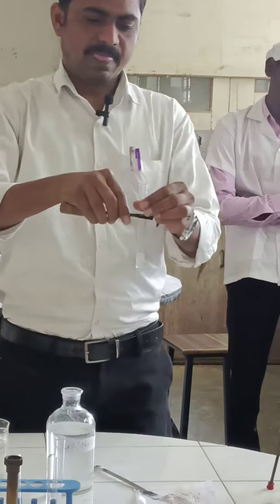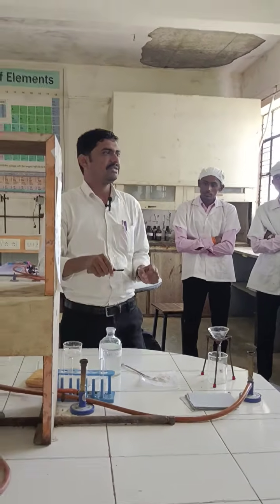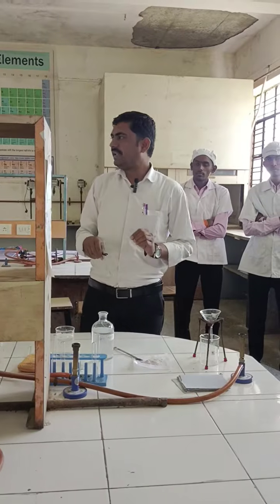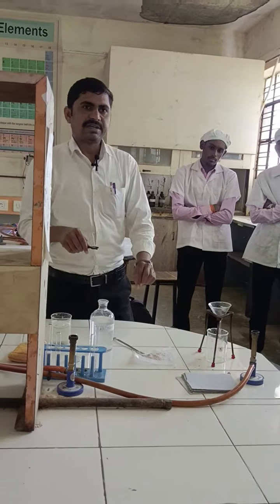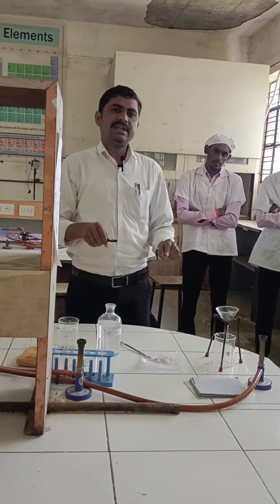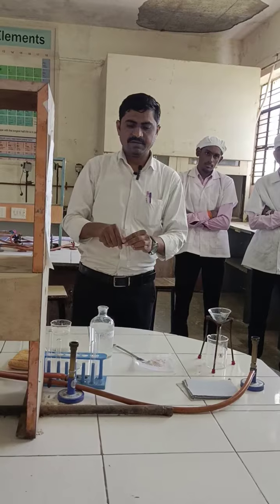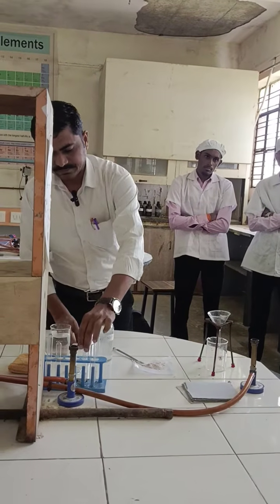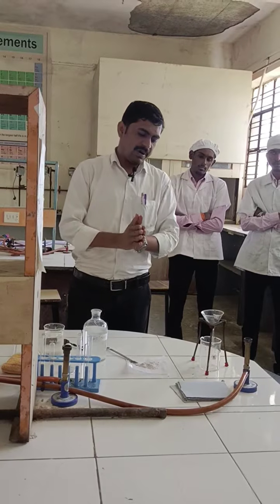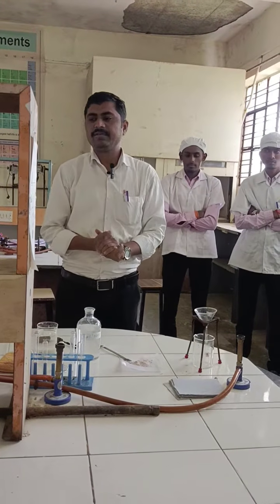So this is a test using sodium bicarbonate. The given mixture is partly soluble in sodium bicarbonate. What is the conclusion of this test? In the binary mixture, one compound present is an acid, since it gives effervescence. Since one compound is soluble in sodium bicarbonate, we can start with the separation.